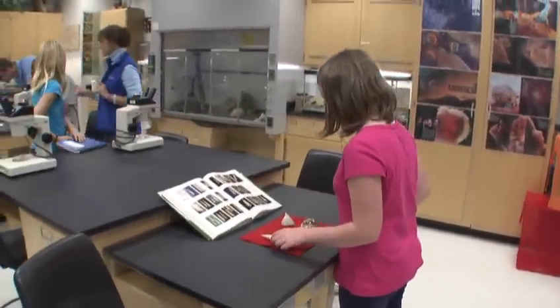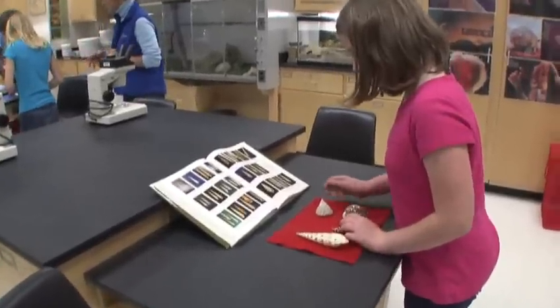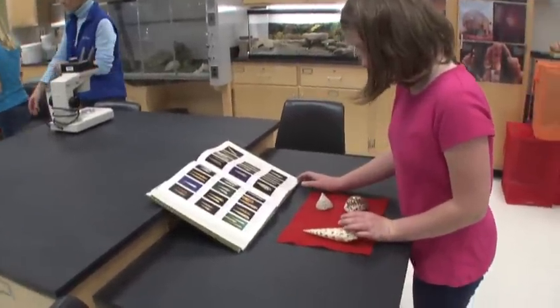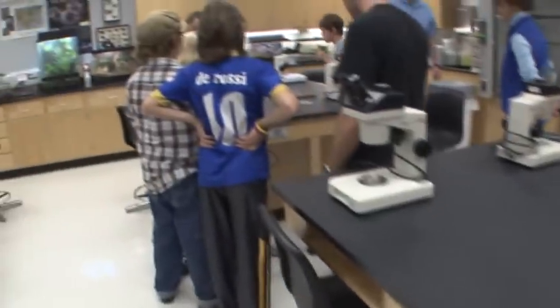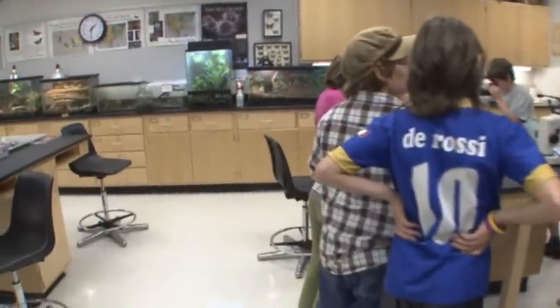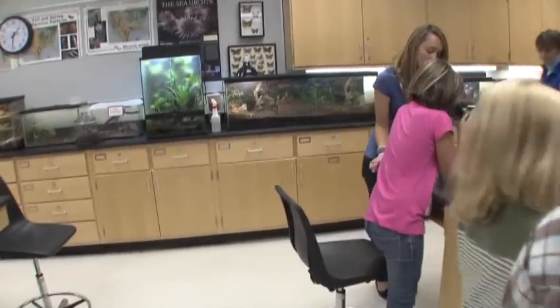Rachel, look at the scopes that are on. Look at this guy, flipping him as he's moving. Isn't that cool? Now watch the bristles. You can see the little gills or little finger-like things. Which isn't really what we're talking about, but it's still kind of cool looking.